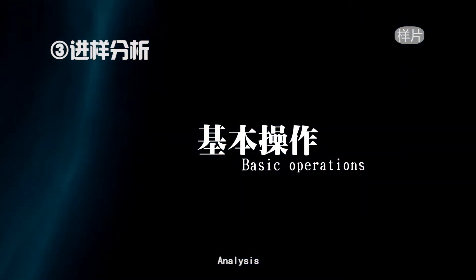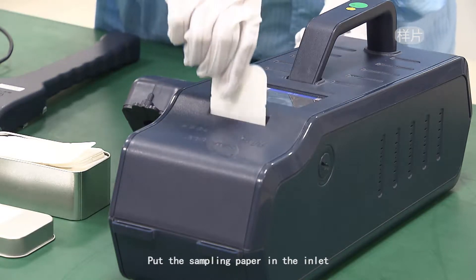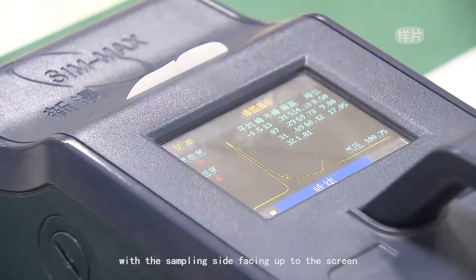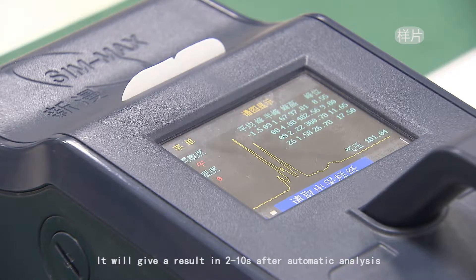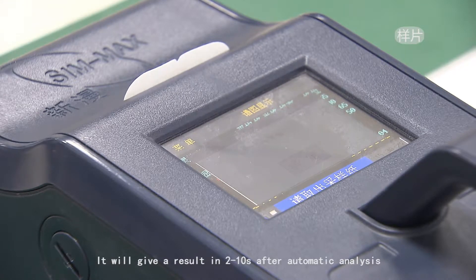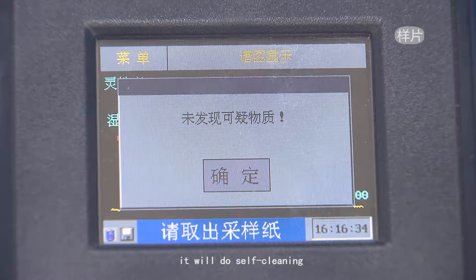Analysis: put the sampling paper in the inlet with the sampling side facing up toward the screen. It will give a result in 2 to 10 seconds after automatic analysis. Take the paper and tap OK, and the device will perform self-cleaning.